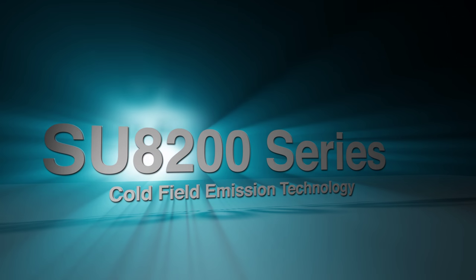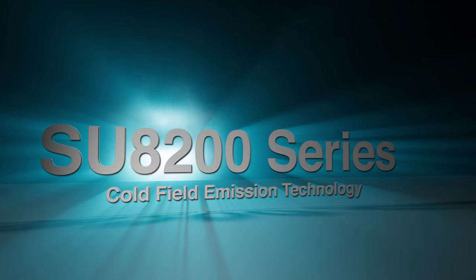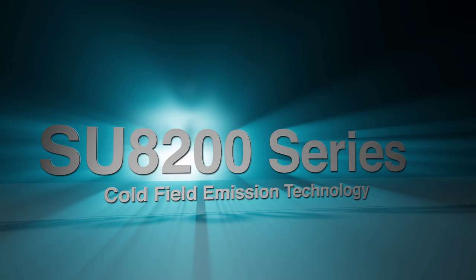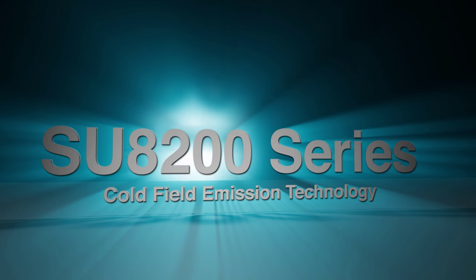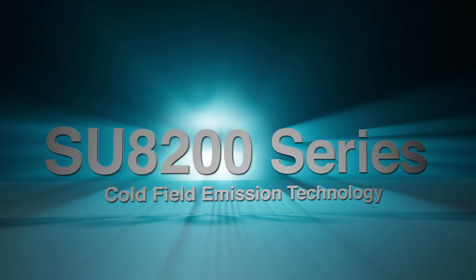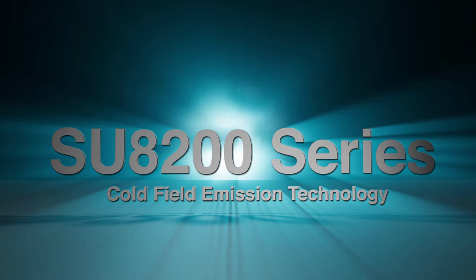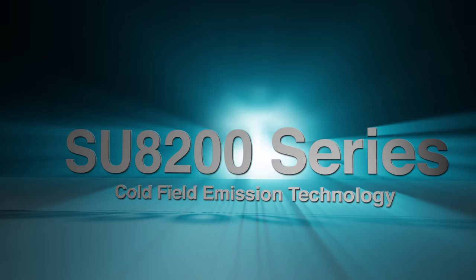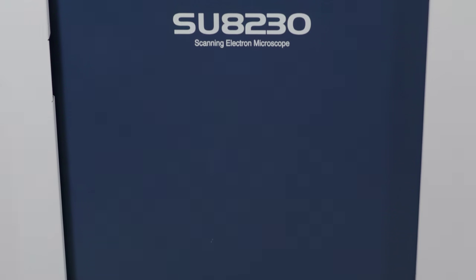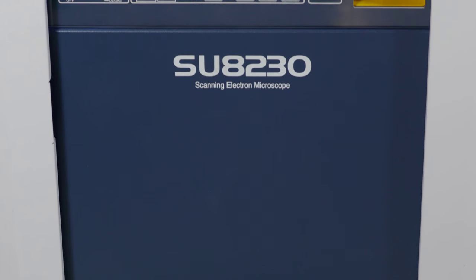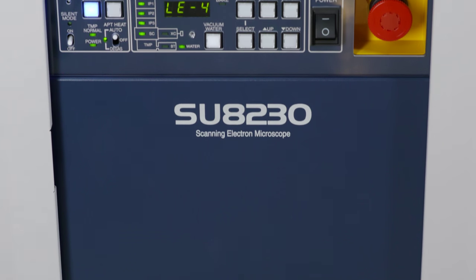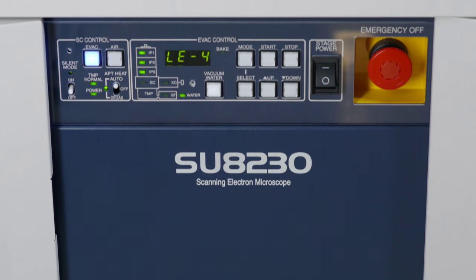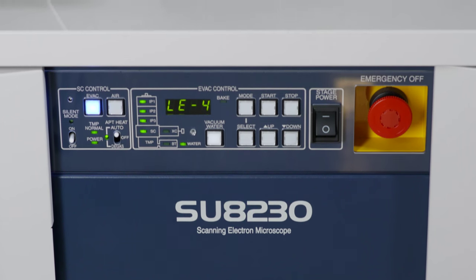Introducing the reinvention of cold field emission with our new and innovative Hitachi SU8200 series, providing the ultimate in resolution with beam stability comparable to current thermal FE-SEMs. Hitachi is proud to introduce the latest addition to our innovative product lineup of electron microscopes.